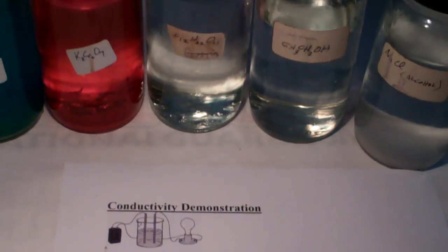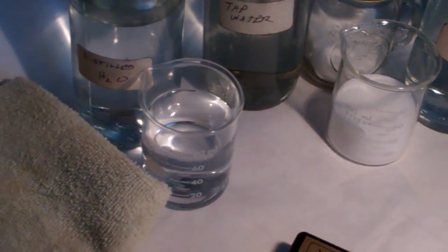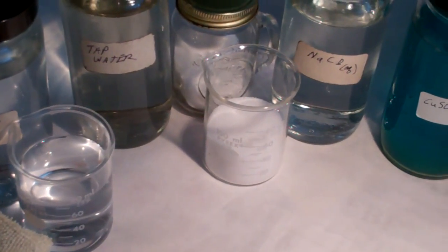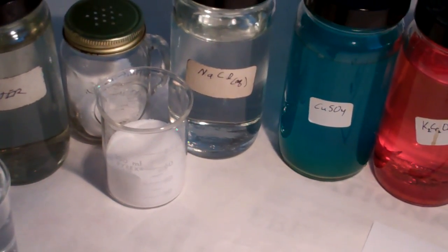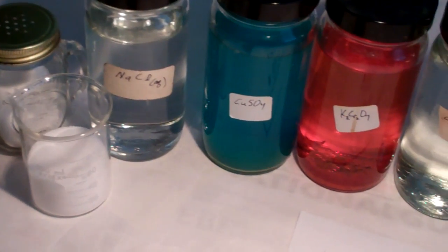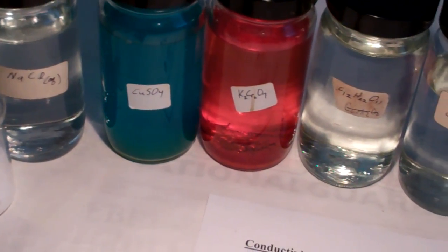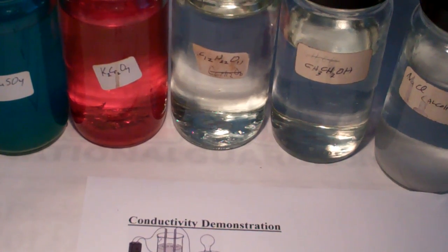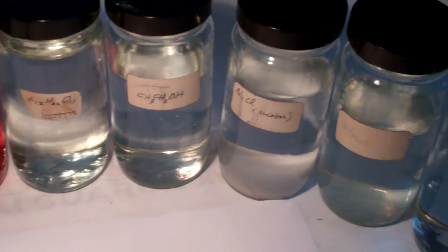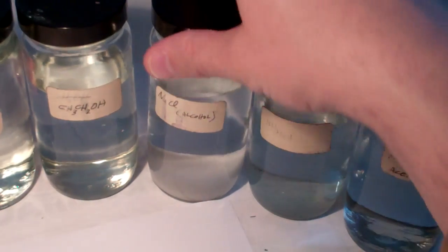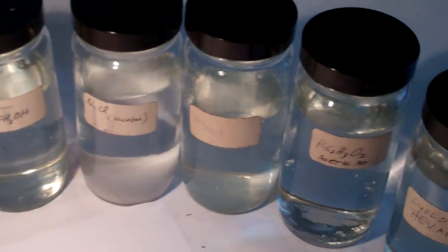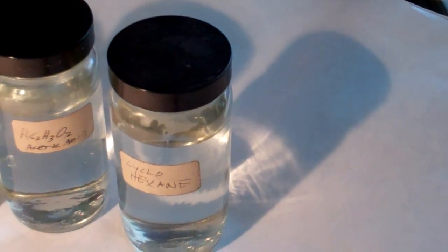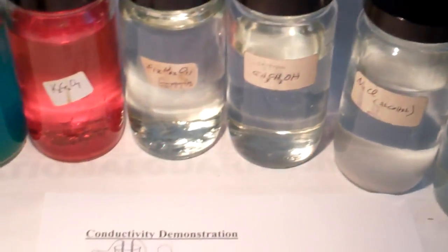So the solutions we're going to use today, or liquids or solids, will be distilled water, tap water, table salt, sodium chloride dissolved in water, copper sulfate dissolved in water, potassium dichromate dissolved in water, sugar dissolved in water. We have some ethanol, then sodium chloride and alcohol, ammonia, acetic acid, and then finally cyclohexane.